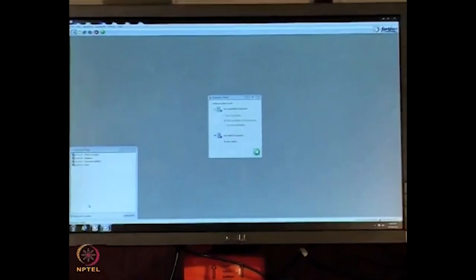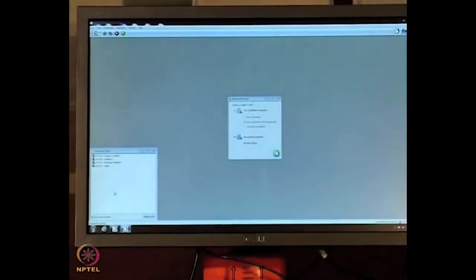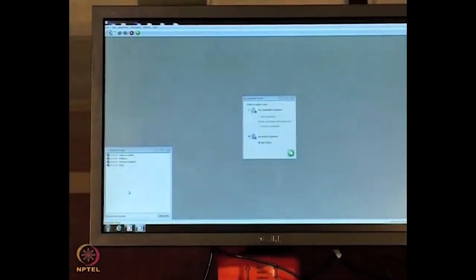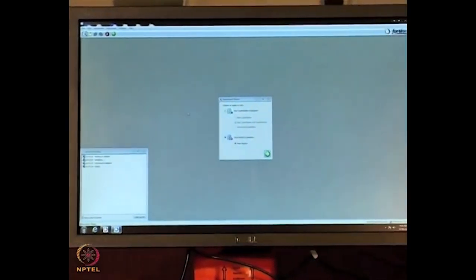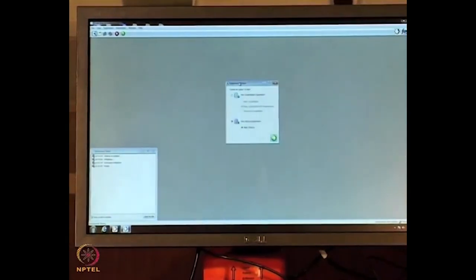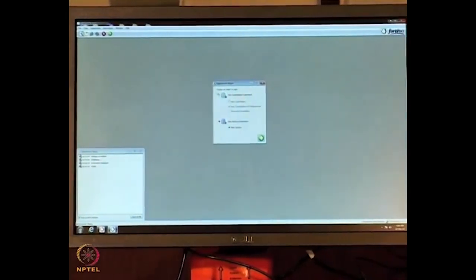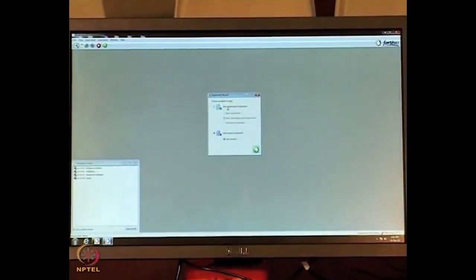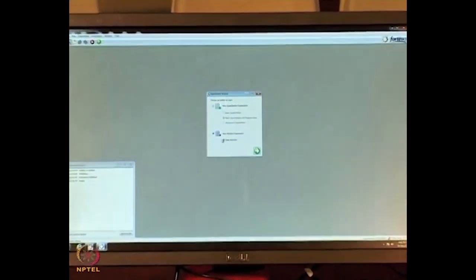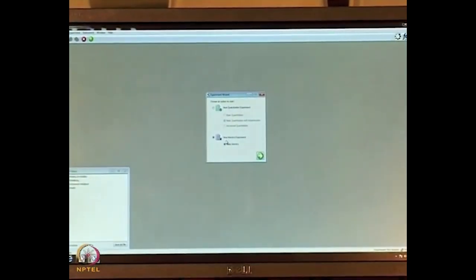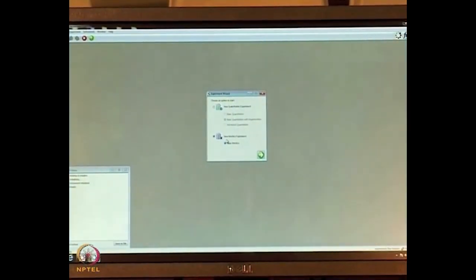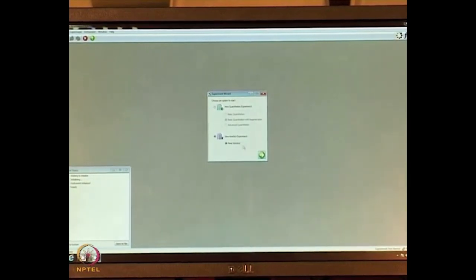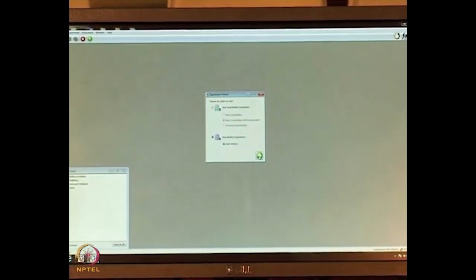Now we can start the experiments. When the acquisition software opens, we can see an experimental wizard. In the wizard there are two major experiment types: whether you want to do a kinetics experiment or a quantitation experiment. We are going to perform the kinetics experiment by clicking on the green arrow.